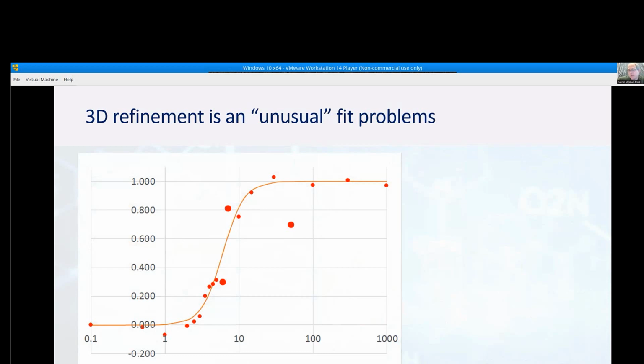And this is the biggest issue in the field, and you will see very soon why it's called the Einstein from noise problem. On top of that, you can already understand that if I would like to place many different projection images and decide what the directionality is to solve this structure, this is actually an unusual fit problem. And the reason that I say unusual fit is because what you see here is a classical experimental statistical fitting problem. We have some kind of an underlying model.